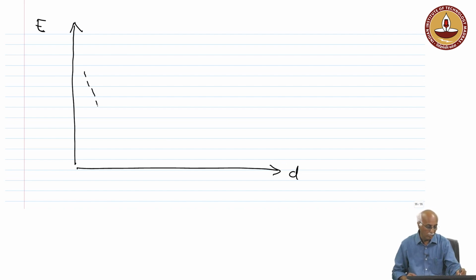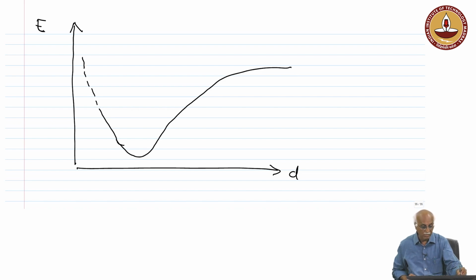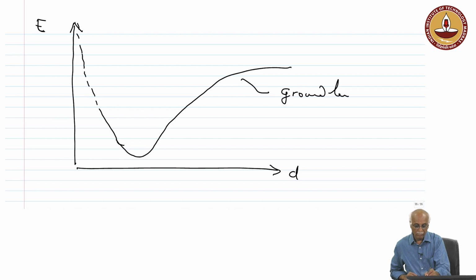It will have a certain energy level depending upon the distance between the atoms, and within this, let us say this is the ground energy level.